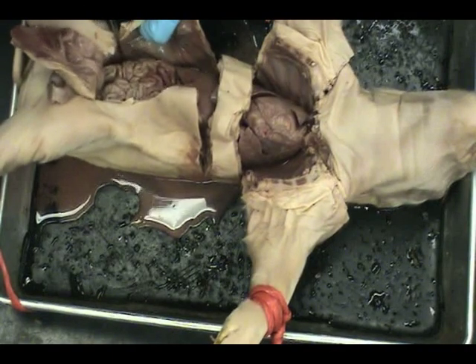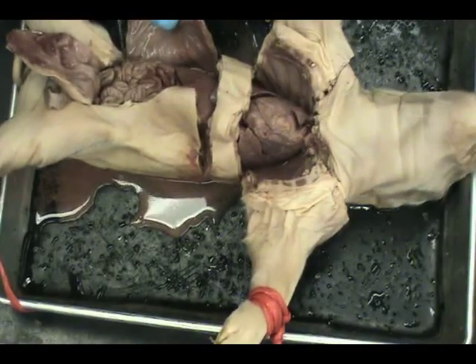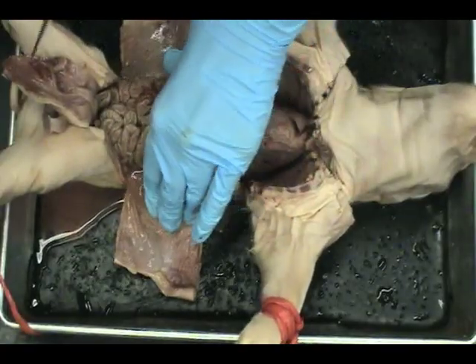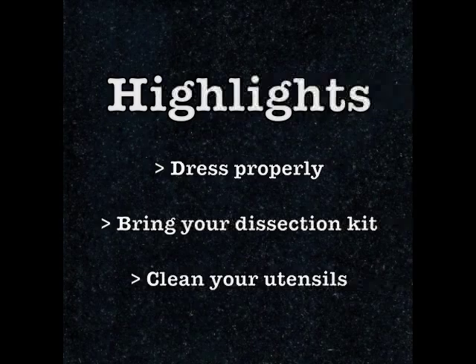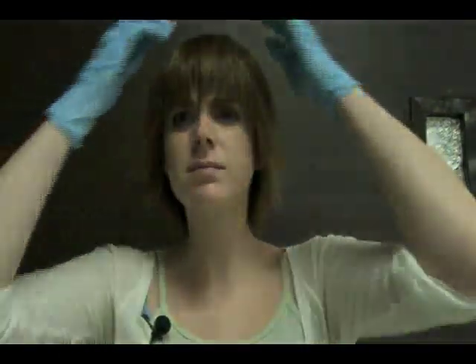Finish opening the abdominal cavity with two cuts towards the dorsal surface. They are parallel to the diaphragm. Be sure to locate and identify the organs. Discard your dissected fetal pig in a biohazard trash.